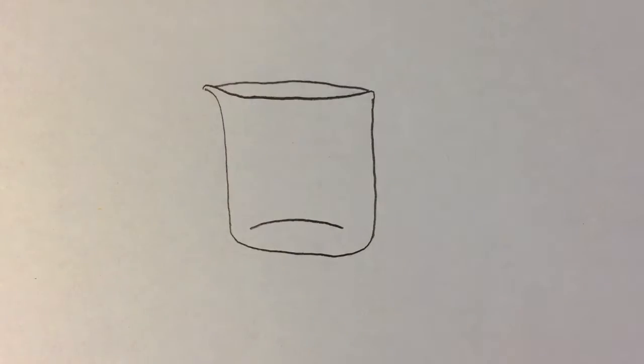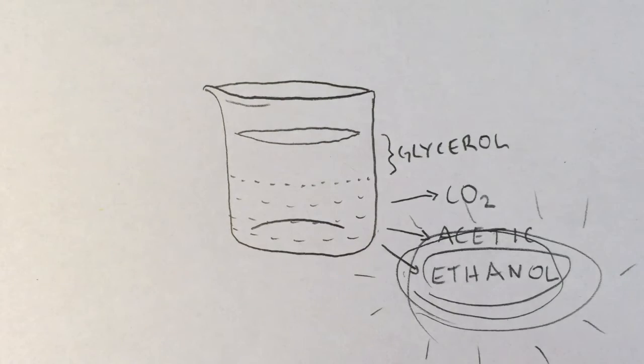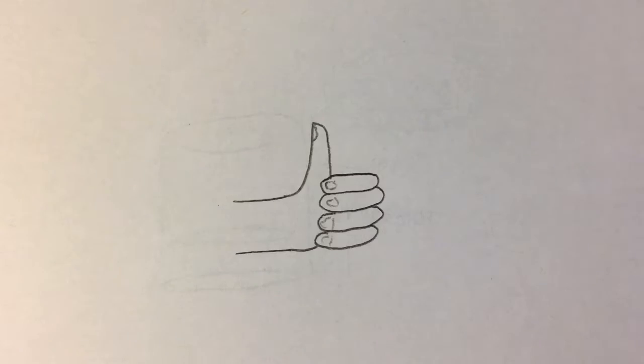About half of what was glucose is now glycerol, but the ratios of the other substances depend on other variables. However, the general trend is the more glucose and the longer it's fermented, the more alcohol.